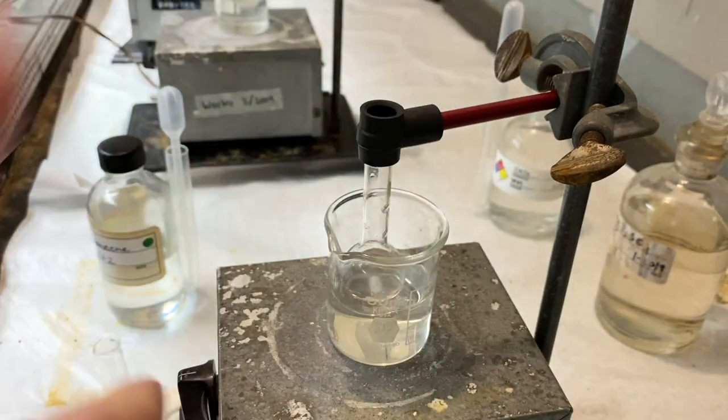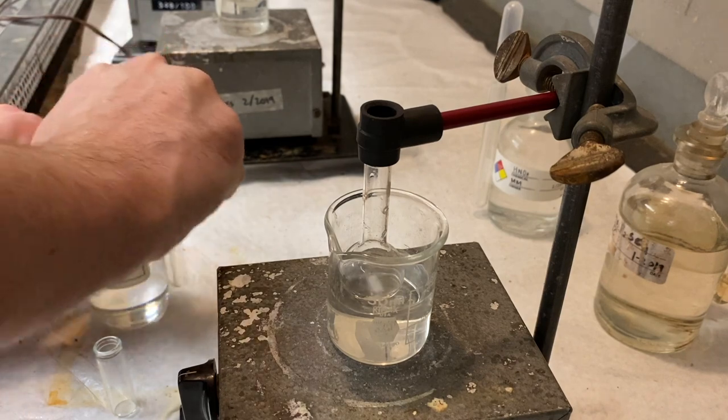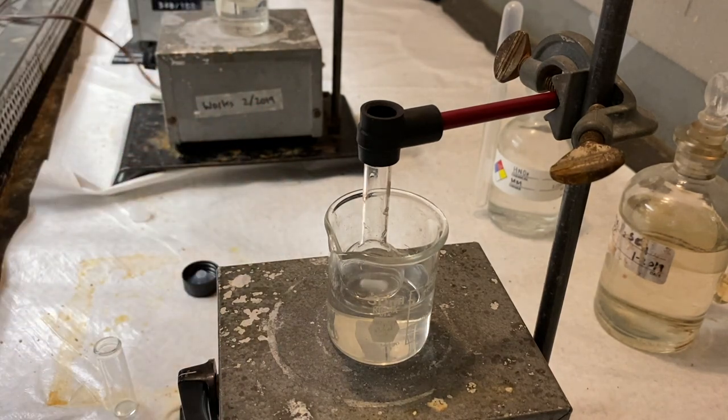So we'll add that one drop at a time for a while here. So I'm going to get about half a milliliter up into this dropper.